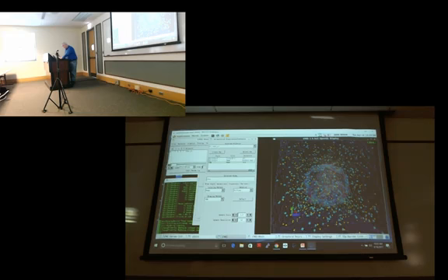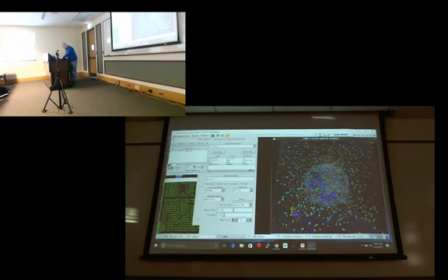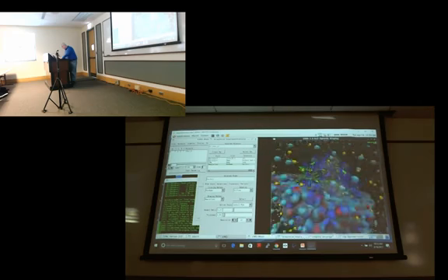And I think I'm going to go ahead and add the RNA. And I'll say nucleic. Oops, if I can spell. So there's the nucleic acids, and I'm going to draw them using the new cartoon representation, which will just draw ribbons. And I'm going to color them by residue. No, not residue. I forget what I want. There we go. By residue name. So now I can see the nucleic acid inside there, right?